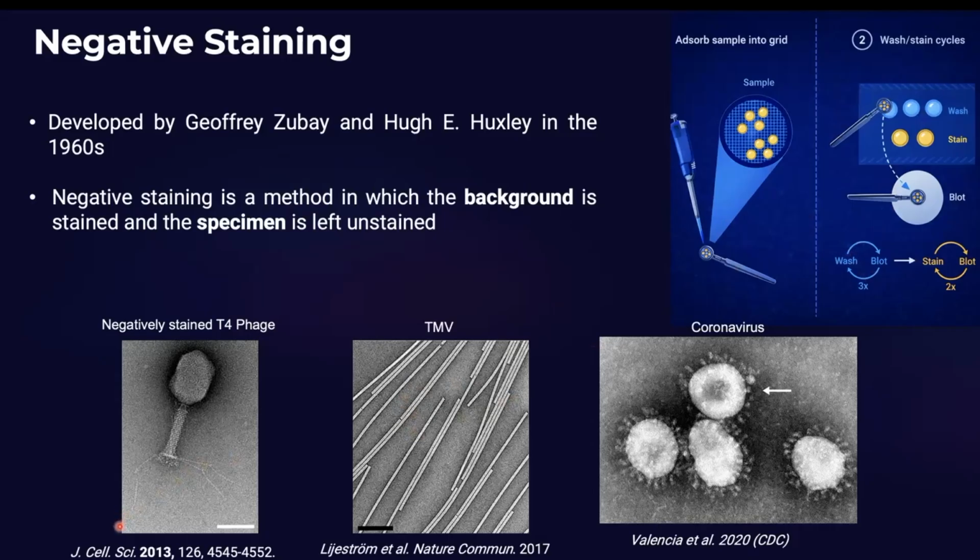However, the challenge is that if you work with a biological sample, you can get the structure, but you cannot distinguish some of the secondary structures of proteins. And secondly, it is a dried sample. This is not the native structure, so you cannot get more insights.